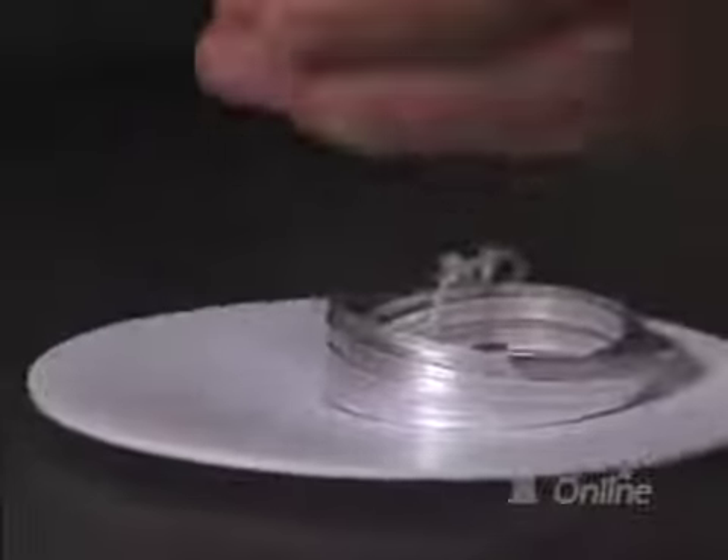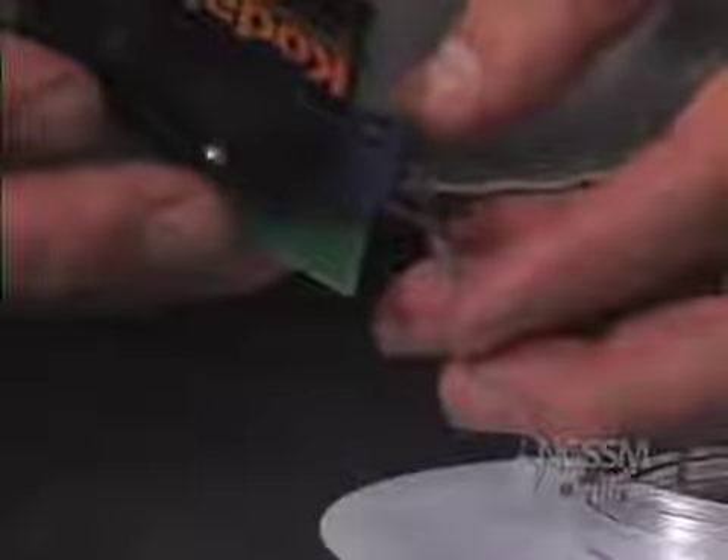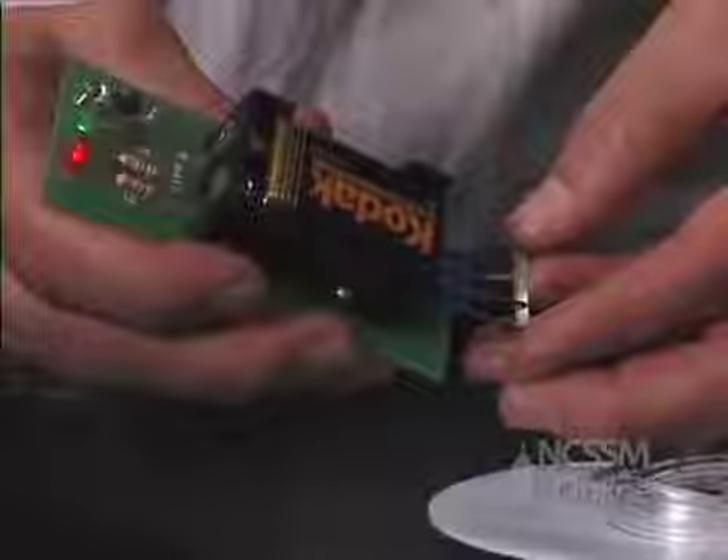The magnesium is an excellent conductor of electricity, as we can see using our conductivity tester. It's also a very malleable, flexible metal.